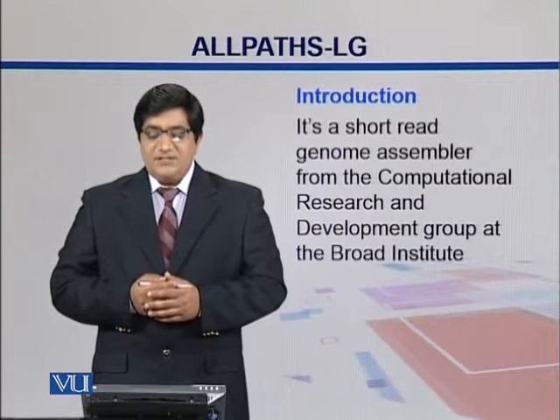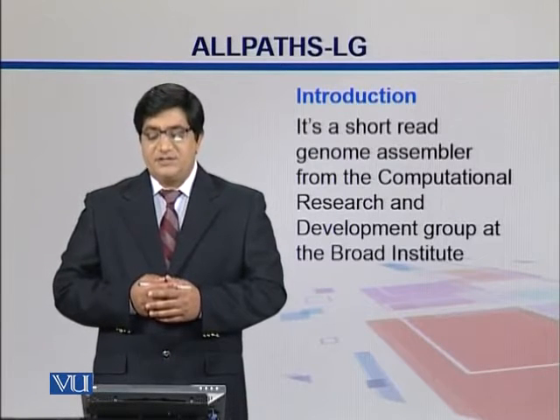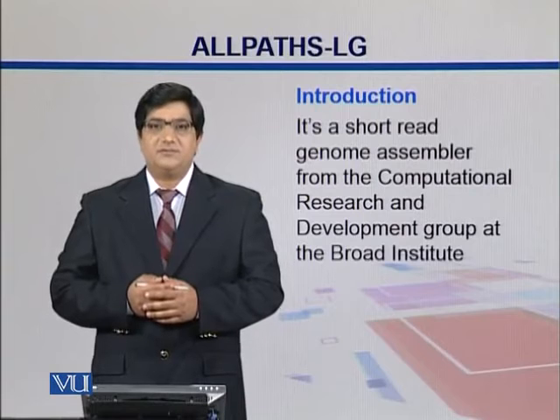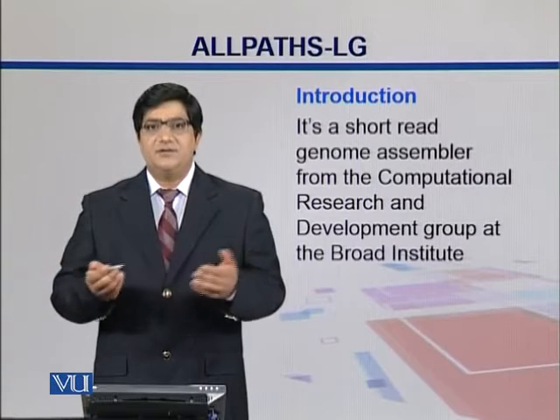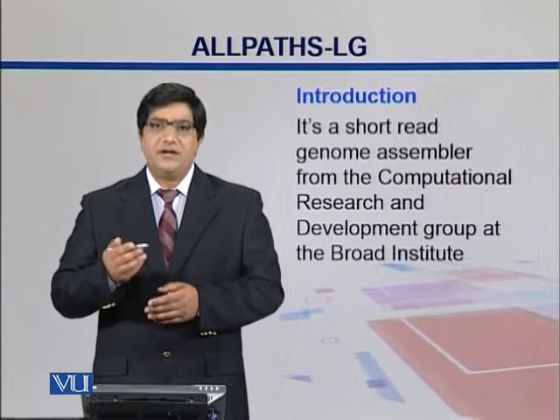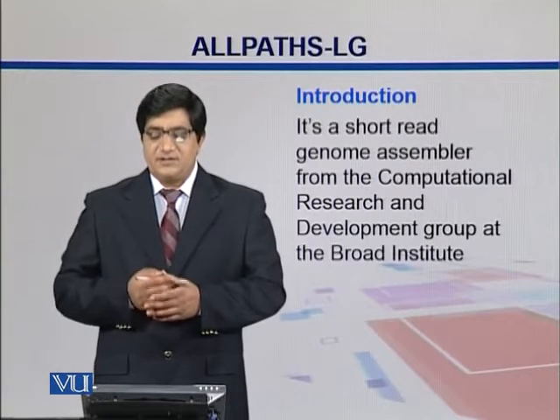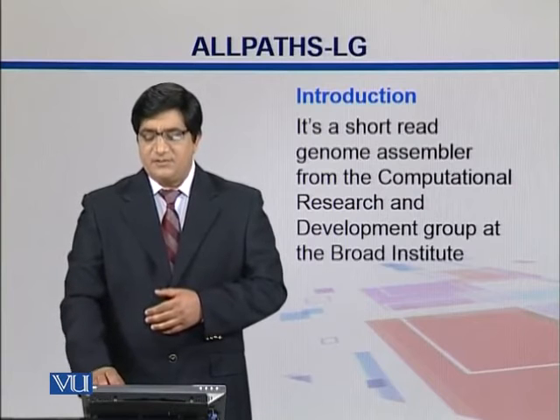ALLPATHS-LG is a short read genome assembler from the Computational Research and Development Group at the Broad Institute. Remember, we talked about the Broad Institute regarding the generation of high throughput data in some previous sections. That institute also has this genome assembler put together.